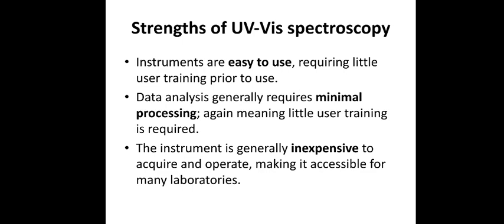You are only supposed to load your sample, and there are settings, you just switch it on and your readings will be available. Data analysis requires minimum processing because as soon as the detection is done, there will be a display of your result. So analysis is not tiresome, so easily you can get the report, and that means minimum training, just operating, if you know, then easily you can get the results. It is also inexpensive, in the sense that once you have installed it, the running charges are very low, so it is comparatively affordable, so most laboratories make use of it.